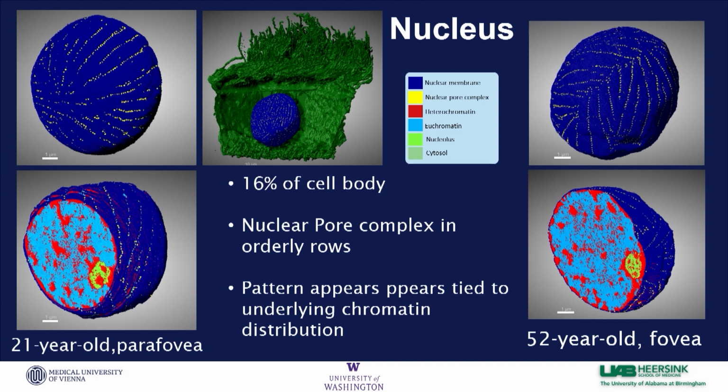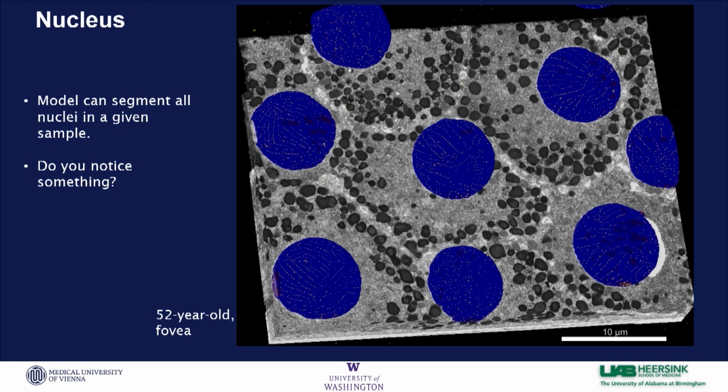And using that same model, I was also able to segment all of the nuclei in the sample. I think this was 20 frames tops for training, and within a few days, we could segment all of the nuclei in the given sample.